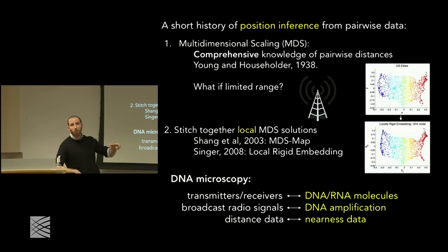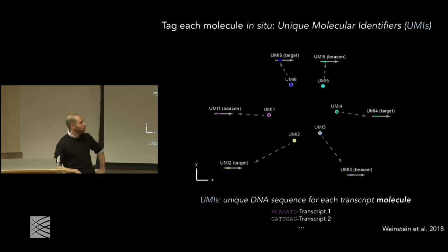Okay, so with that in mind, it's possible for us to go to the actual experiment. What we're going to start out with is, in this case, a very kind of cartoonish picture of how the experiment works. Let's just imagine that what we've already done is we've taken a sample and we've fixed and permeabilized it so we can get reagents in. So the sample is dead, but all of the molecules are going to remain in place.